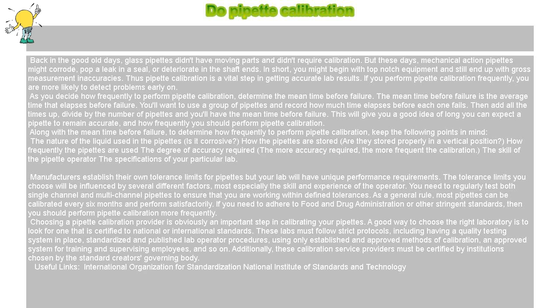Is it corrosive? How the pipettes are stored. Are they stored properly in a vertical position? How frequently the pipettes are used. The degree of accuracy required. The more accuracy required, the more frequent the calibration. The skill of the pipette operator. The specifications of your particular lab.